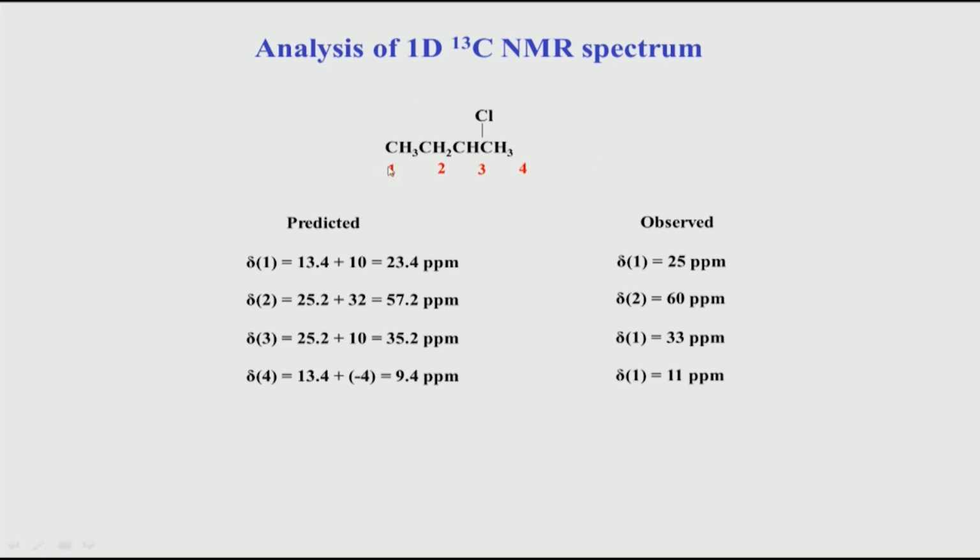So, given a structure of a molecule, the idea here is that you should be able to predict this chemical shift and you will be having the experimental value with you. So, it helps you to assign which peak will correspond to which carbon. This is basically the goal behind this exercise: given a spectrum and given the structure, suppose I want to do a mapping or a matching of which peak in my carbon spectrum corresponds to which atom in the molecule.